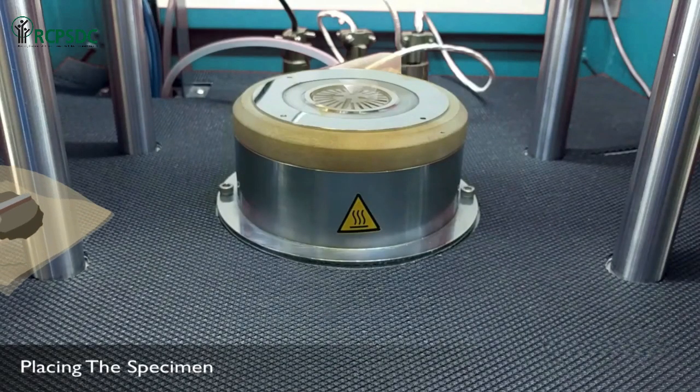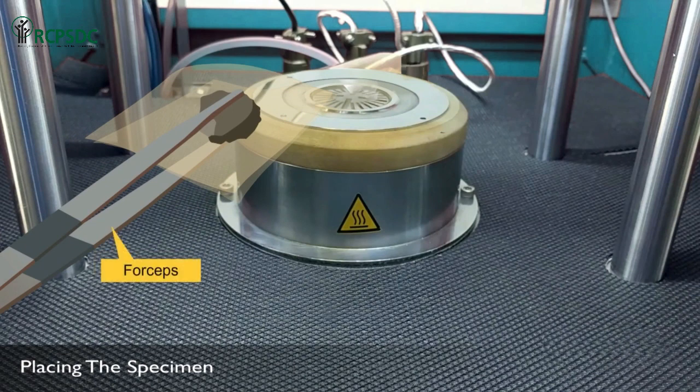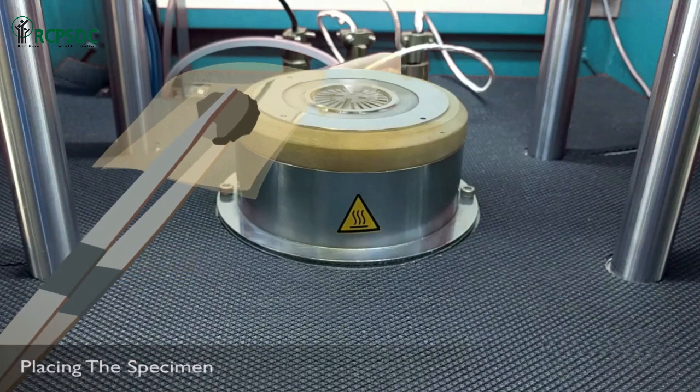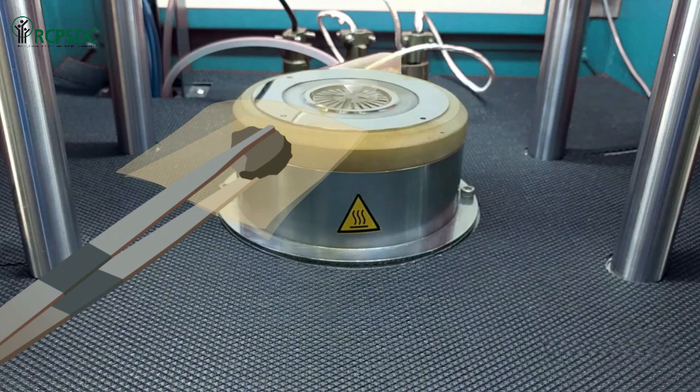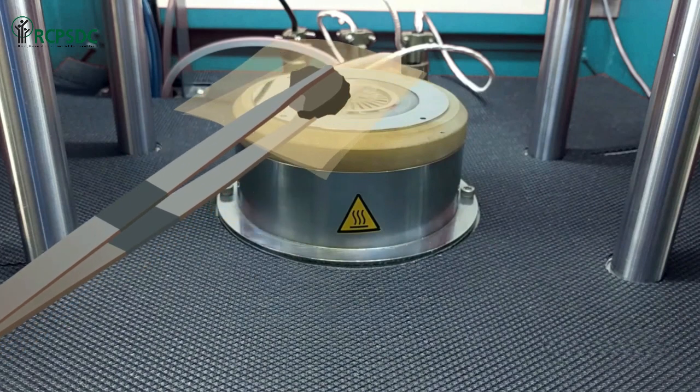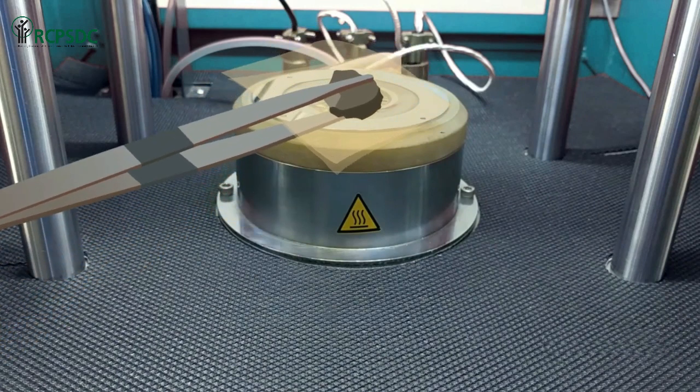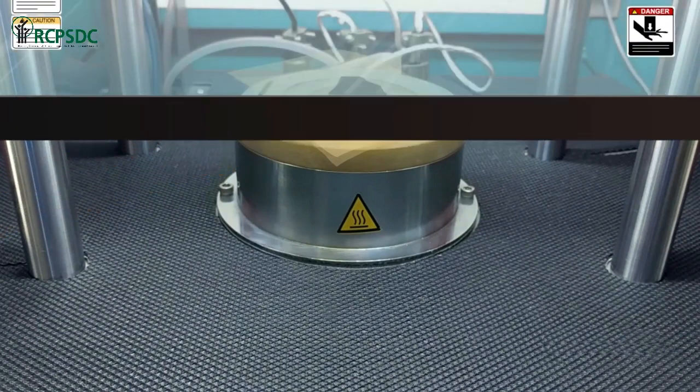Keep a piece of plastic sheet on the top and bottom of the test sample before keeping it on the machine's test block. Place the specimen on the lower die.